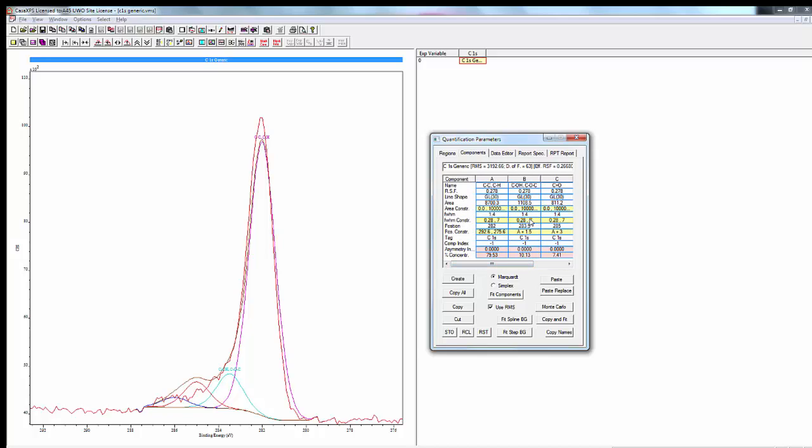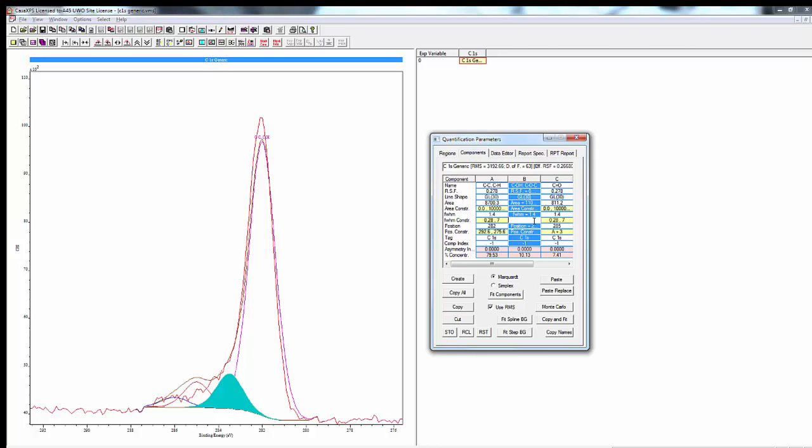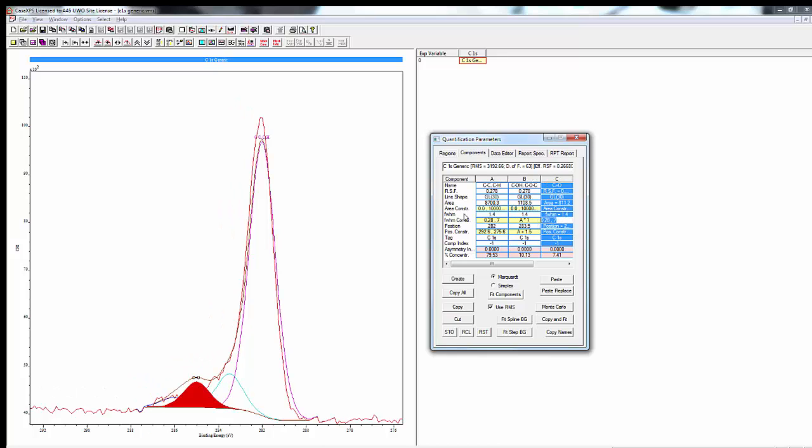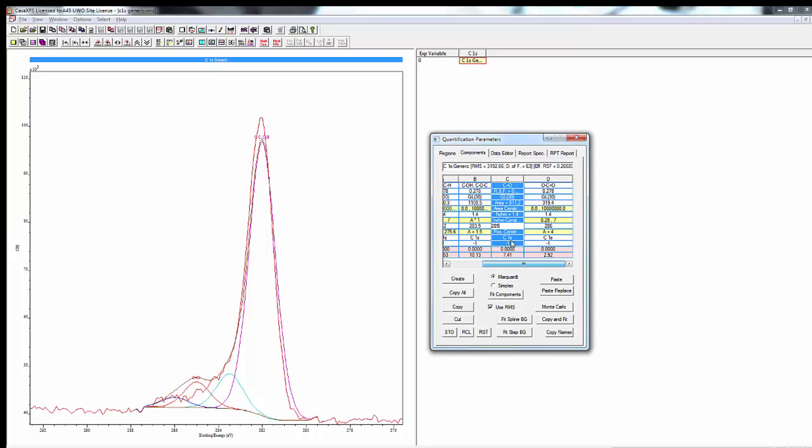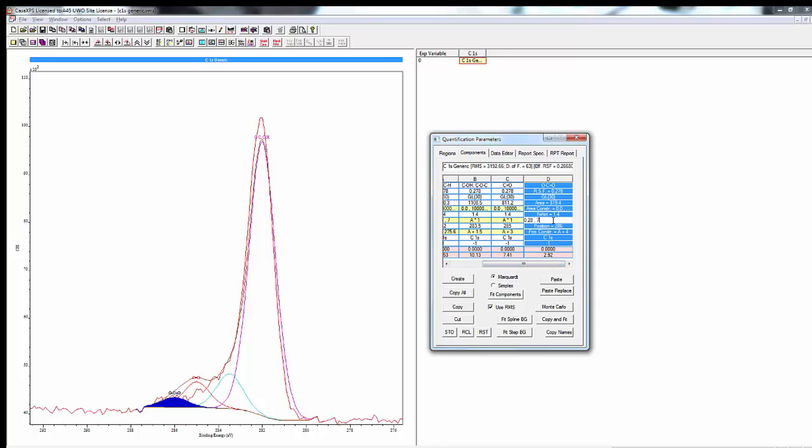Generally I set, for something like adventitious carbon, the full width half maxes to all be the same. That won't necessarily be the case for everything. If you have the resolution in the peak and you can see that it's narrower or broader, you can change that later, but this is just a starting point. So A times 1, A times 1, and A times 1.